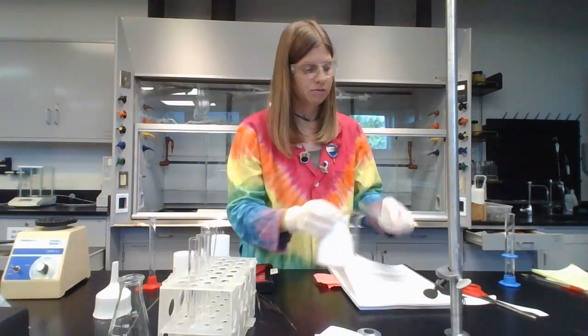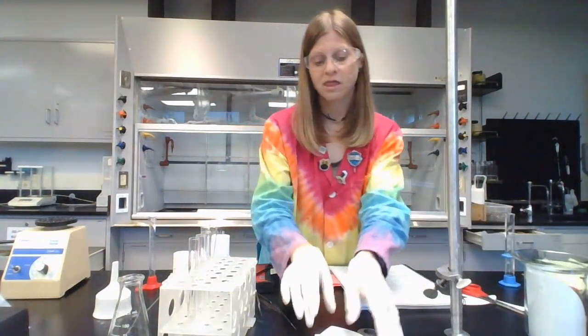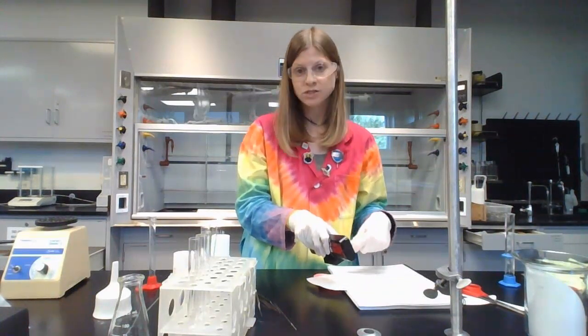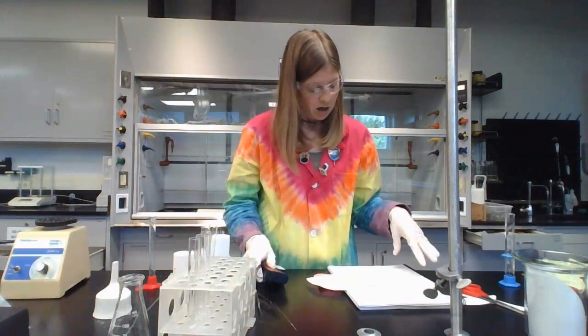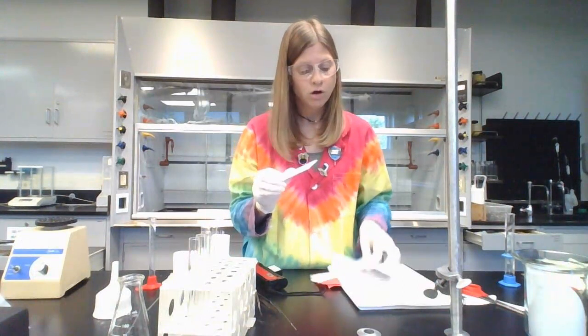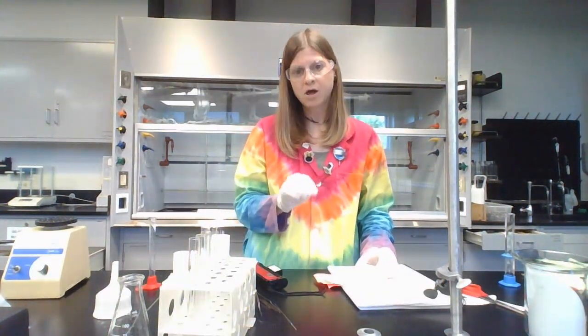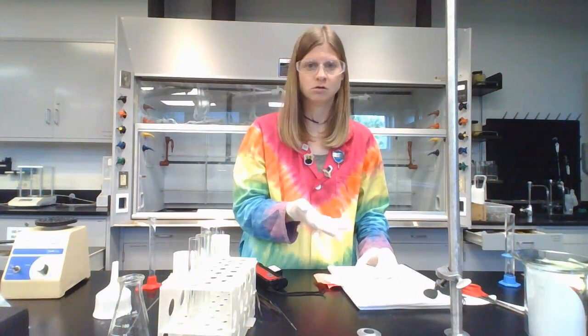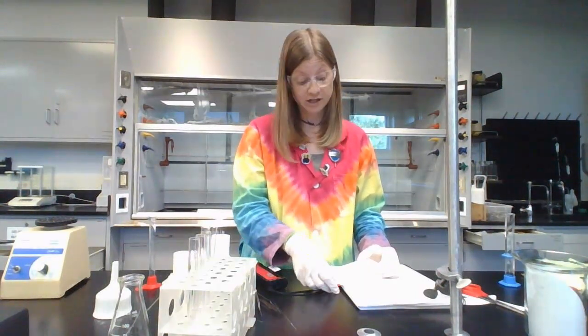Okay. So at that point, we're just letting it dry. Then you will use your UV lamp to again shine on there and look for any spots. So any spots that you see that are not green, circle them with your pencil. In order to translate this into something meaningful, you also need to, while you're looking at the spots, keep an eye on what color the spots are. So when they're treated with the light, are they a different color? So the white stuff is green, right? Maybe one of the spots just looks black, like there's no color. Maybe one of them is dark, but has a little bit of a purple tinge or something. Look for those colors. You're going to record that as well.